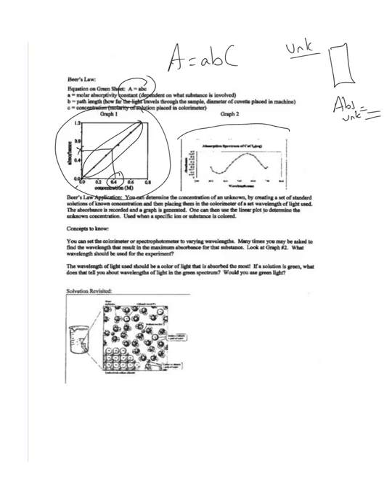One other graph you might see is this one. In this graph, they vary the wavelength. They keep the same substance in the machine and they graph it. They put different wavelengths of light through the sample and they chart what that same sample's absorbance will be at different wavelengths. We usually end up getting a beautiful curved line that has one, maybe two peaks. The peak is the wavelength that we would want to utilize because this tells me the wavelength at which this sample does the best job of absorbing light.